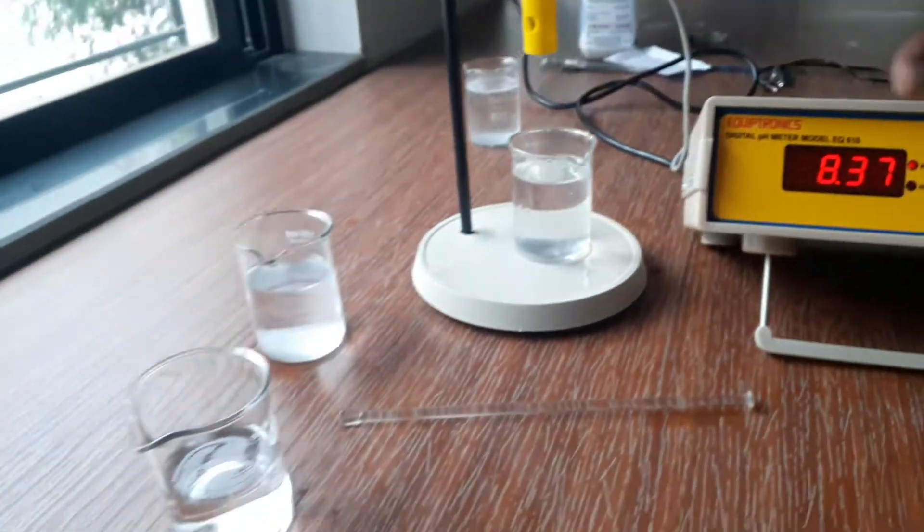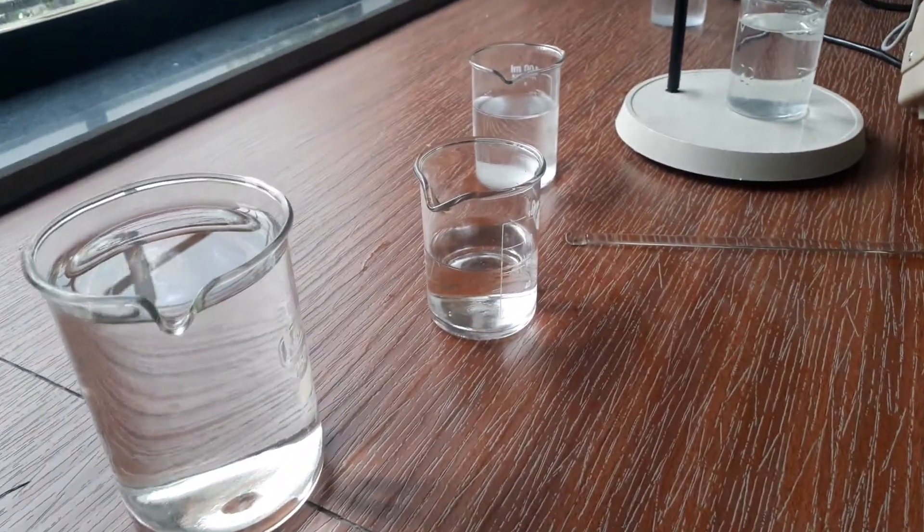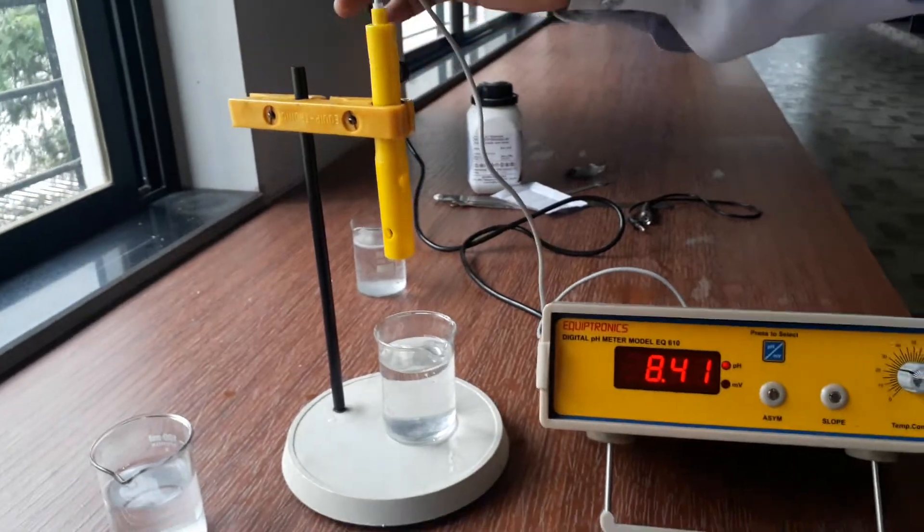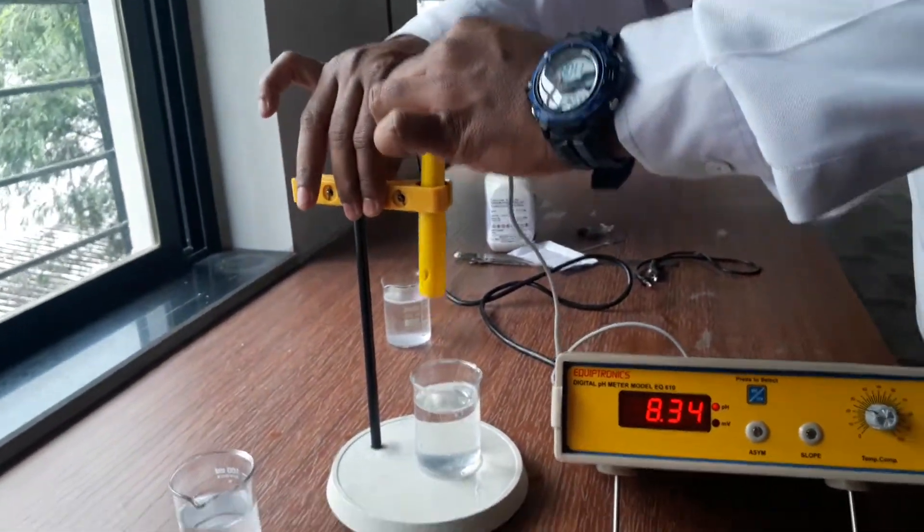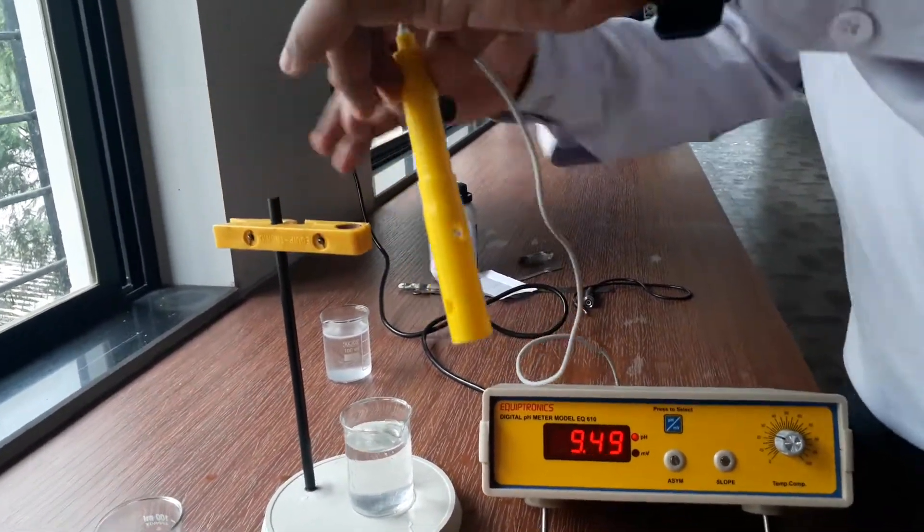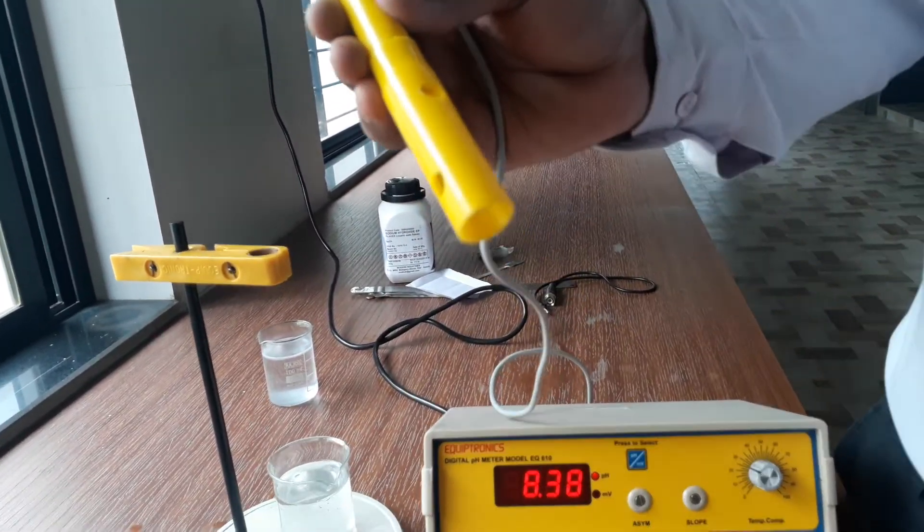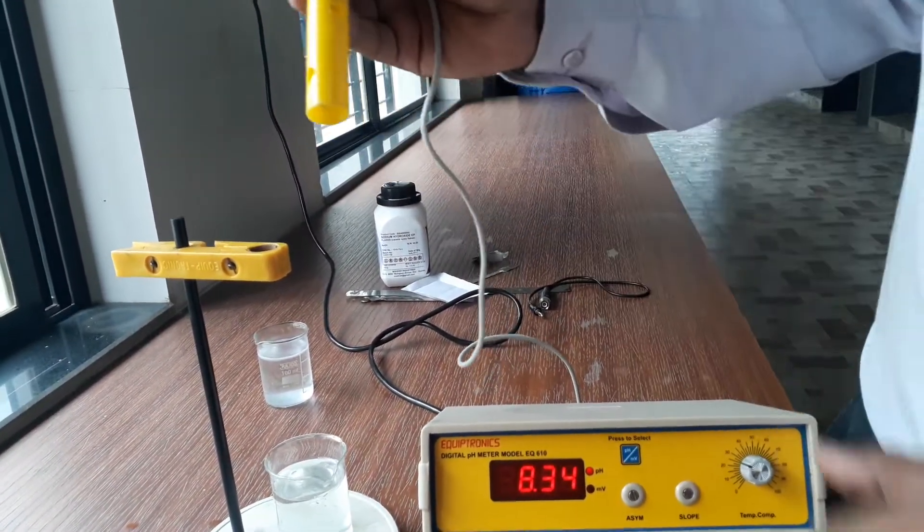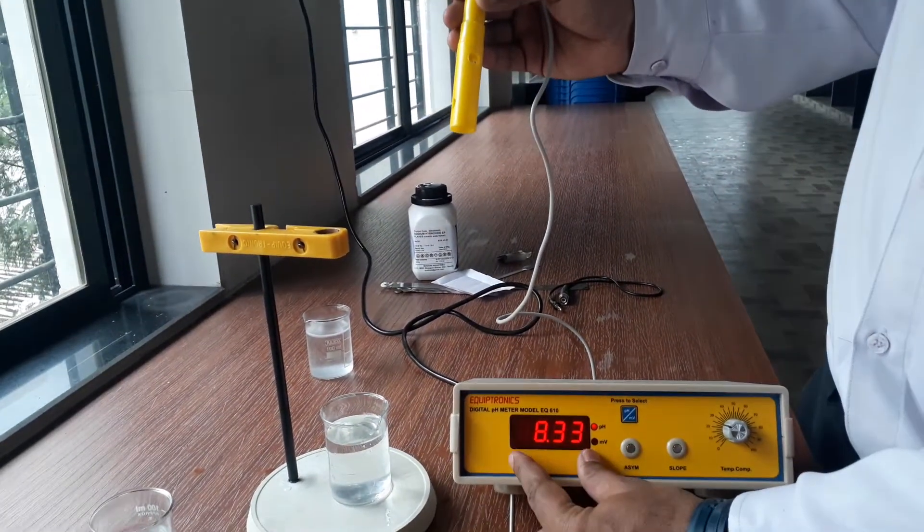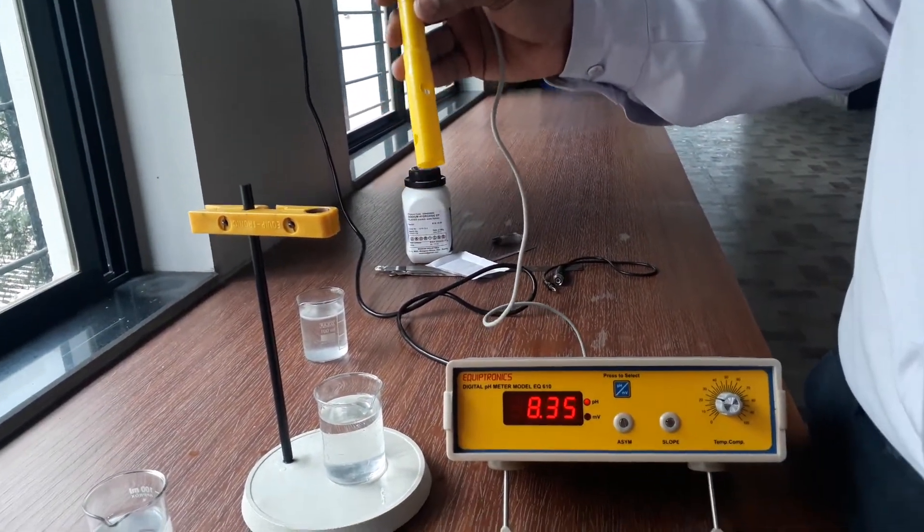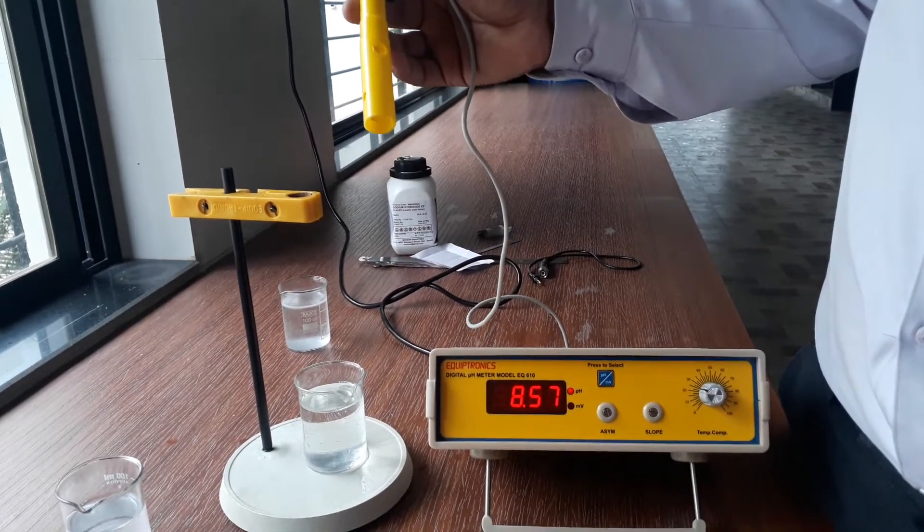We have three unknown solutions. By dipping our electrode, this is the pH meter electrode which is having some special substances in it. These are the sensors which sense the pH value of the solution. Due to this sensor, you are getting the reading on this display. So let us dip this pH electrode in the first solution.